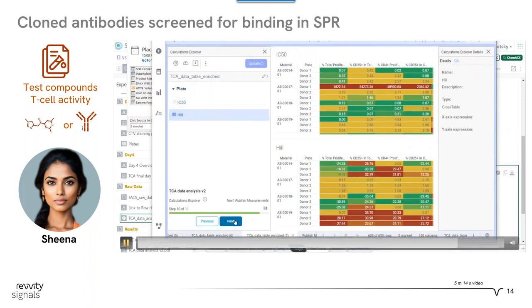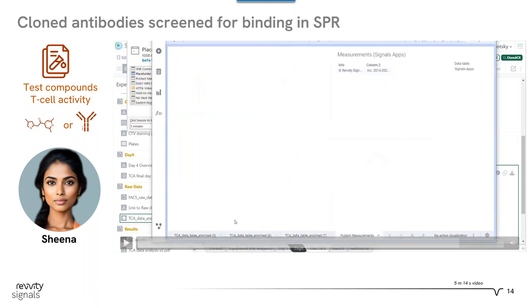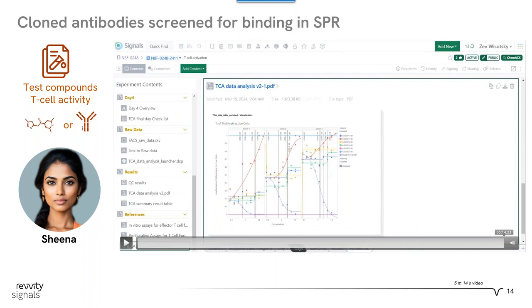So we can, hold on a second, I'm gonna pause this, going a little too fast. So we can actually look at, see if we can go back. Oh, I can't, oh, I just messed it up, hold on a second. One moment, Pete.